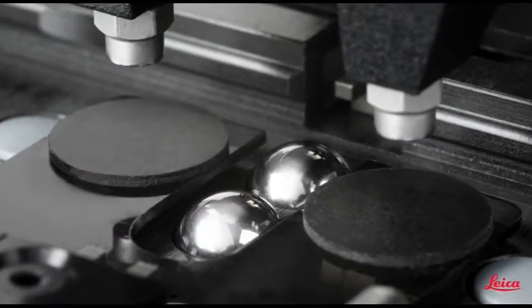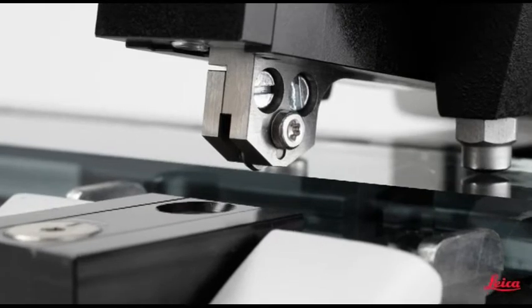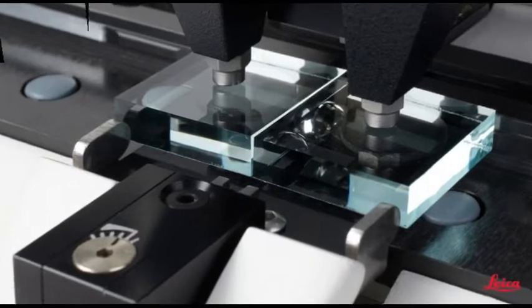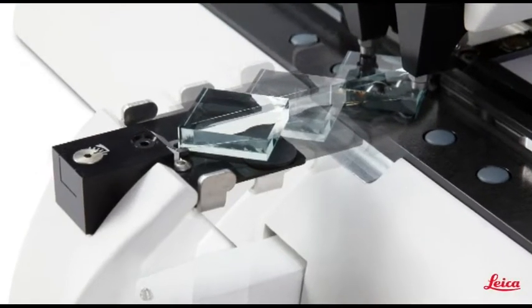The sharp cutting edge of a glass knife is a prerequisite for semi-thin and ultra-thin sectioning. With the new Leica EM-KMR3, perfect knives can be produced from 6-10mm thick glass with minimal skill and effort.